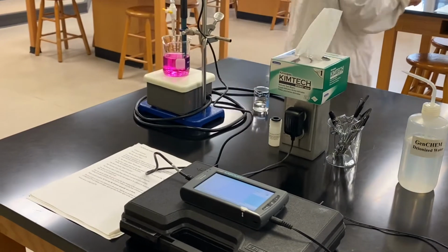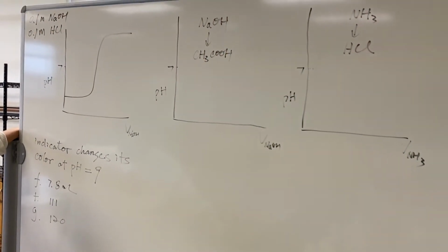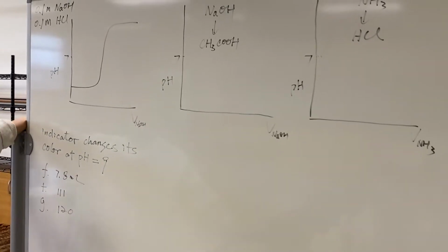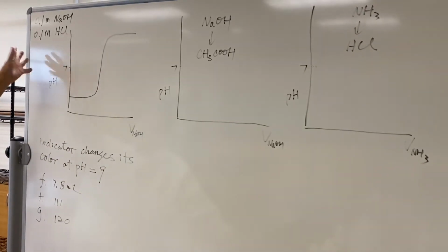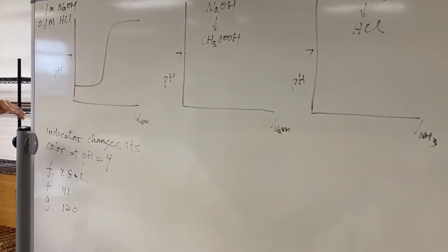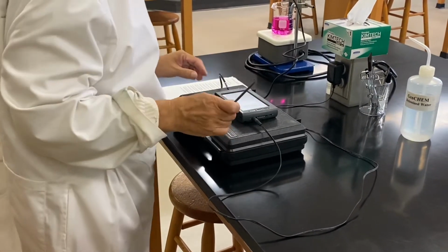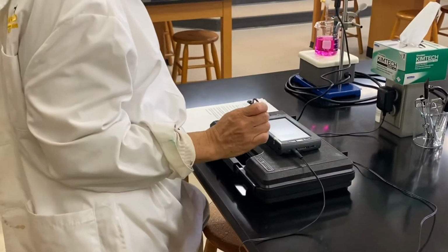As indicated in your lecture graphs, the x-axis is the volume of your titrant. However, we have used time to program the LabQuest graph. Keep in mind that usually there are about 20 drops in every milliliter. And if you set the drop rate to 1 drop per second, you can see the similarity. All right, in the back of our system, there is a pointer. Take it out, equivalency point.